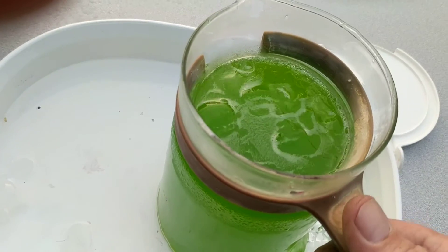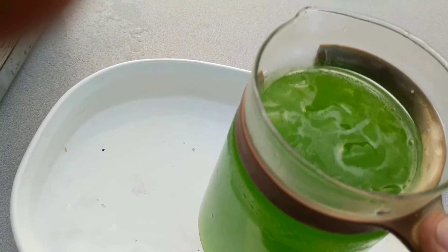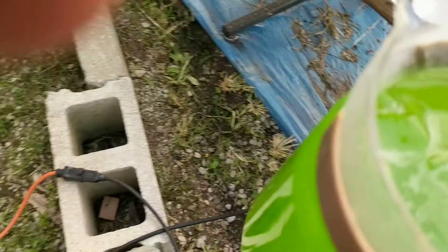You can see some of the film starting on top there. Looks like lime Kool-Aid — but you really wouldn't want to drink that.